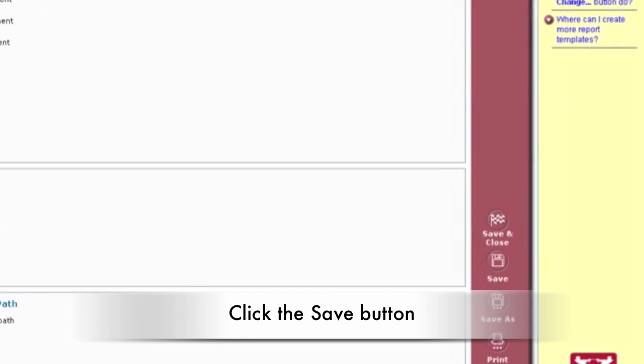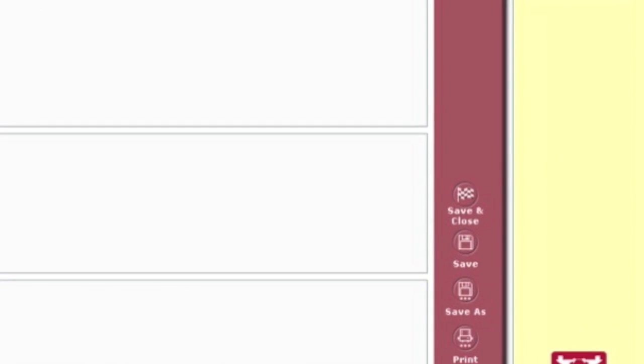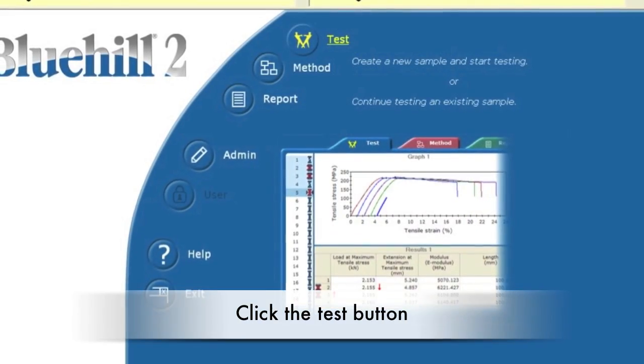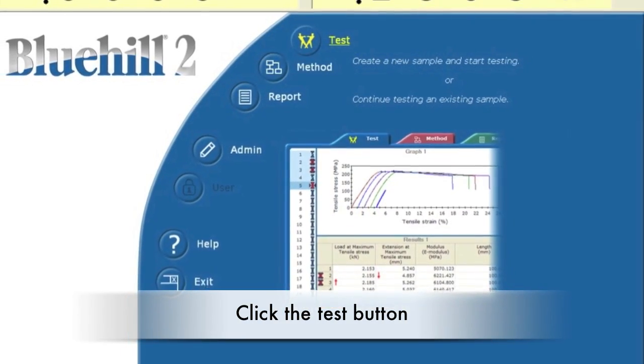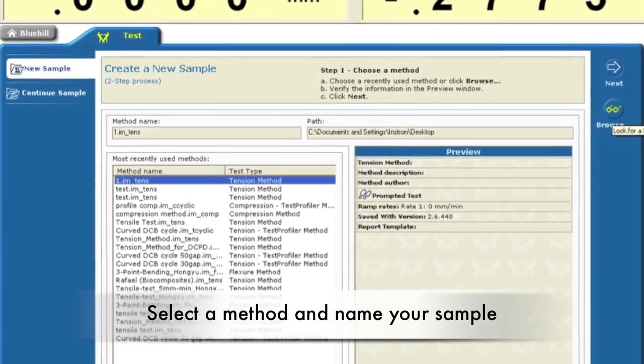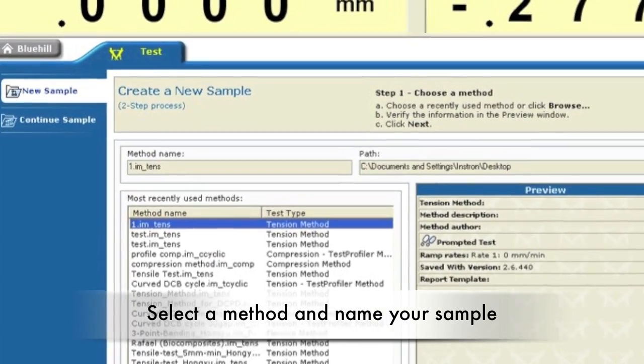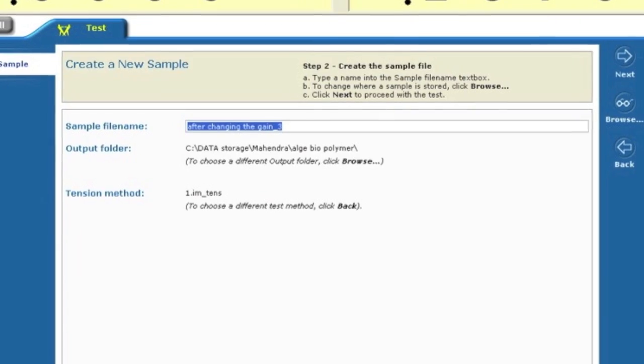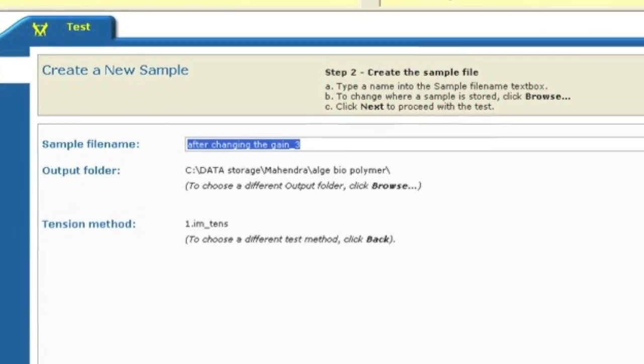Click the save button when finished so the method can be used again. Save your file in your folder of the Instron data folder. Next, click the test button. Choose the method you would like to use by clicking browse and finding your file, then press next. Make sure your results are saved in the right folder, then name your sample, click save, and click next.